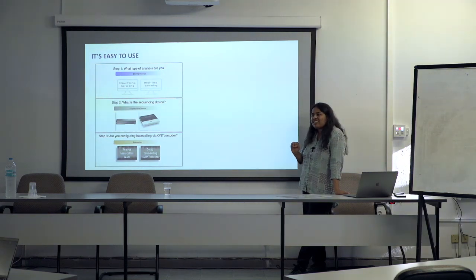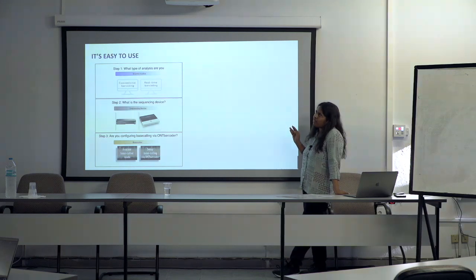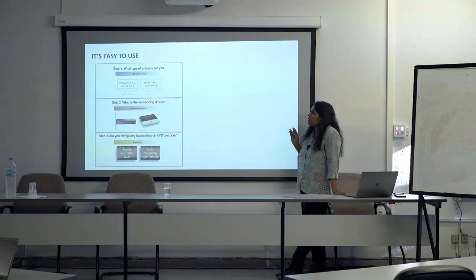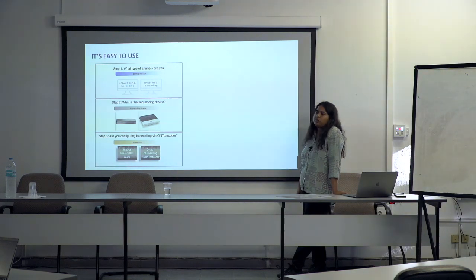Anything with too many homopolymers you have to be careful of. 16S, depending on the group, has that problem. But with 10.4 we are seeing fewer errors of that nature. So I can't give you an answer today for that.